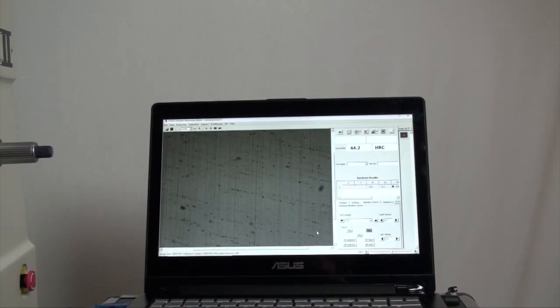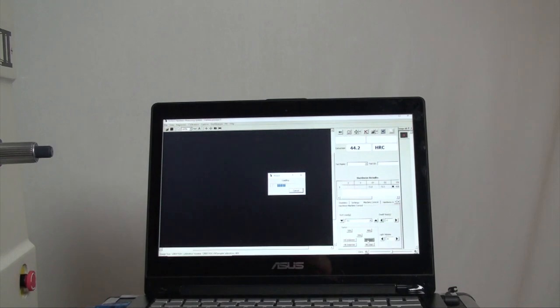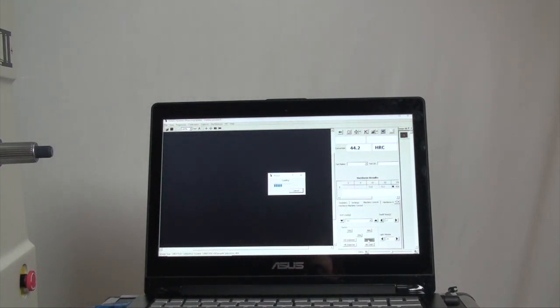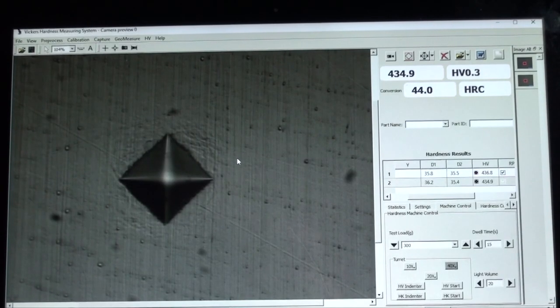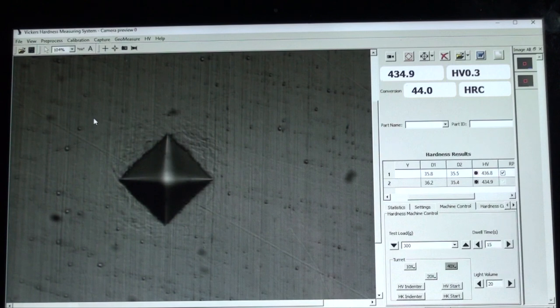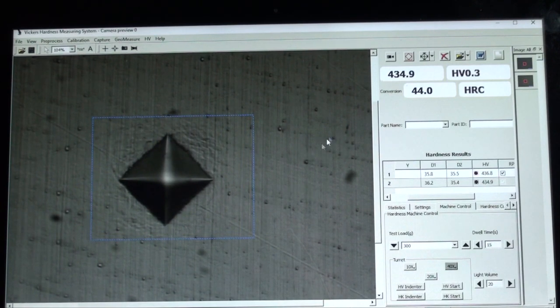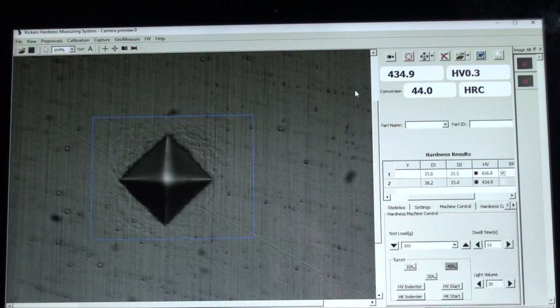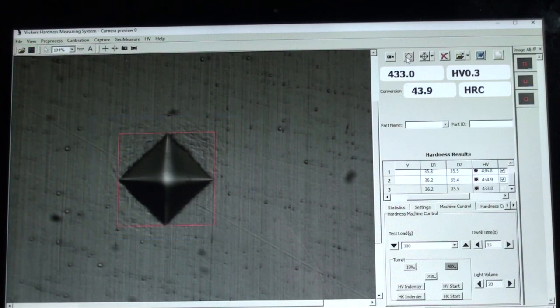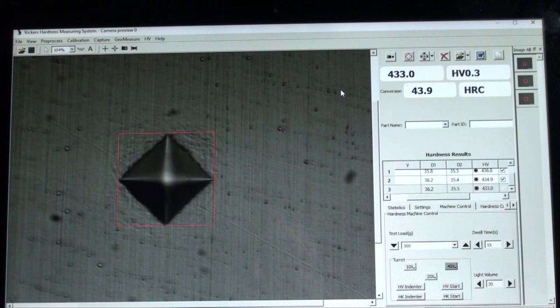On the software screen, press HV start. This will begin the indentation process automatically. The software will control the position changes of the turret. Once the indentation is realized, mouse select a square area over the indentation. Select auto measure if using the B or D version software and the reading will appear along with any converted value if so chosen.